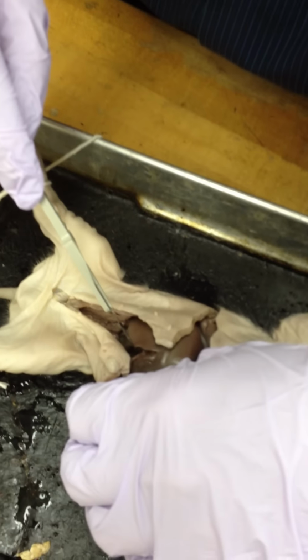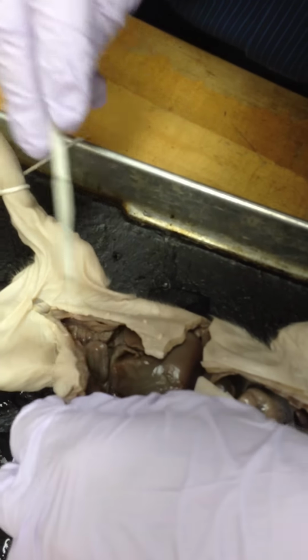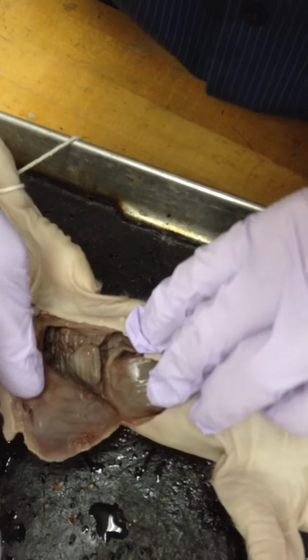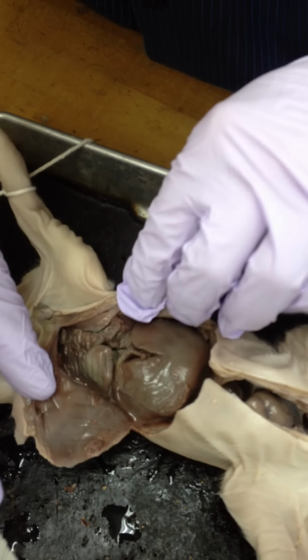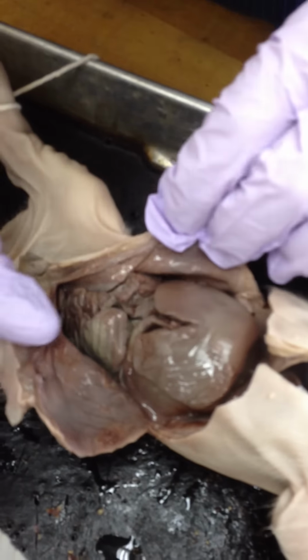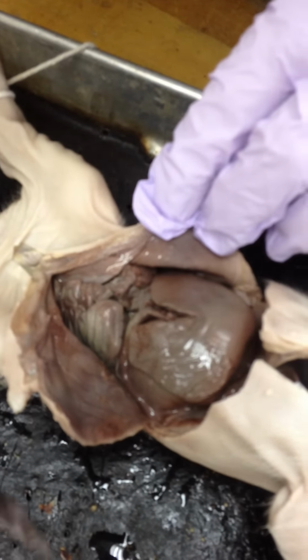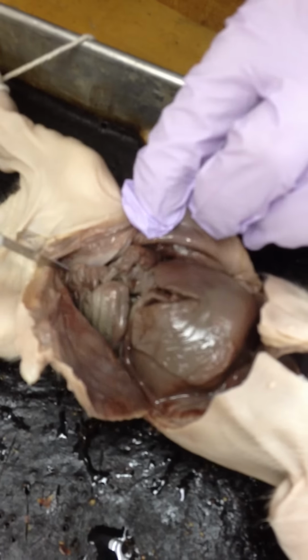Yeah, so there's this. I'm just going to cut this. I don't think I put the microscopes out on the bench top. Do you want the microscopes out? On the bench. Okay. Boy, what a mess. I probably punctured something on my initial cut. Yes, use scissors in the future. It's going to be more intelligent.